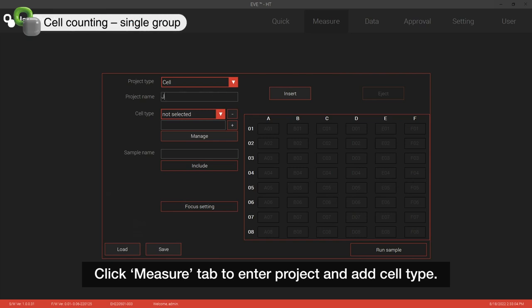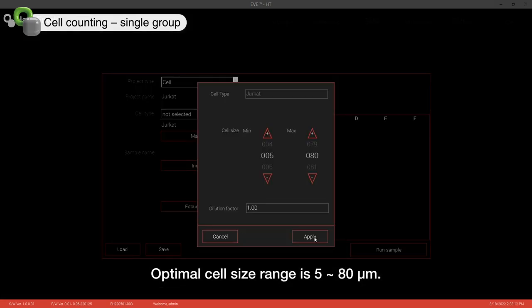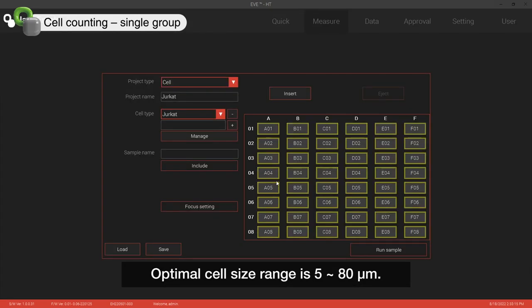Click Measure tab to enter project name and cell type. Optimal cell size range for EVE-HT is 5 to 80 micrometer.